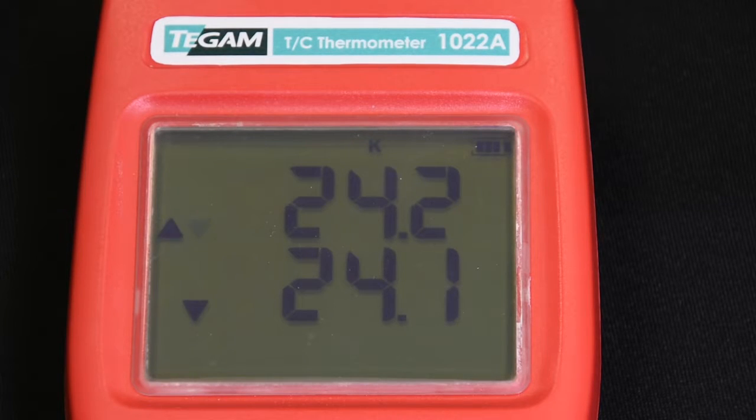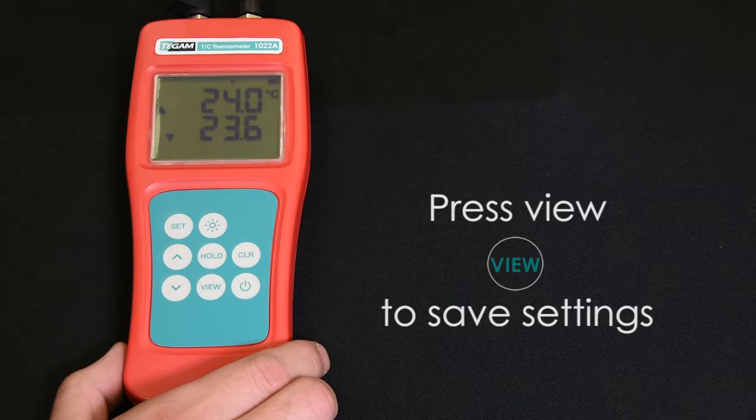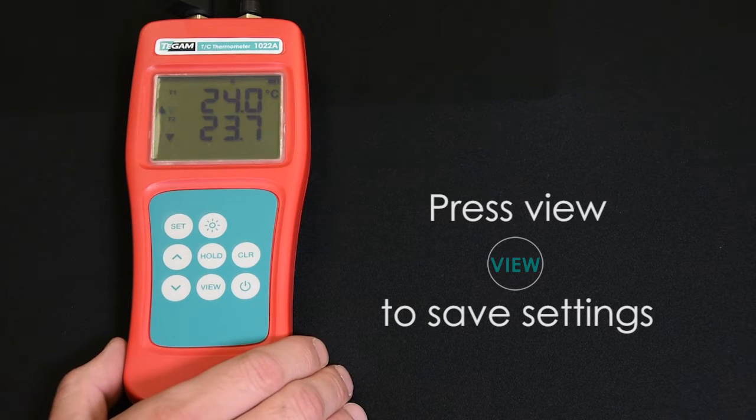When the correct temperature unit is selected, press the view key to save that setting and exit the setup menu.